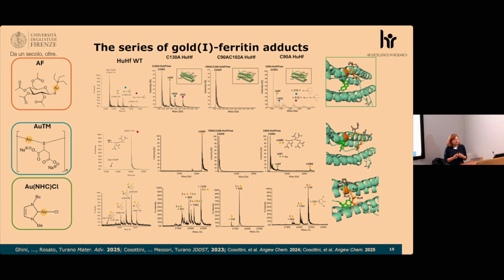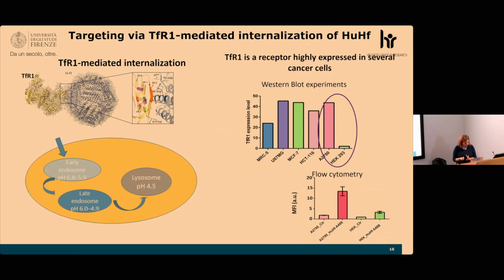So you may lose metal ions, or metal compounds that have entered the cage, or also metal ions that are bound cooperatively to pairs of subunits. And so we combined this with ICP on the intact cage to validate whether the amount of metallation that we determined by mass spectrometry is compatible with the ICP analysis. And this was the case for these 3 compounds.